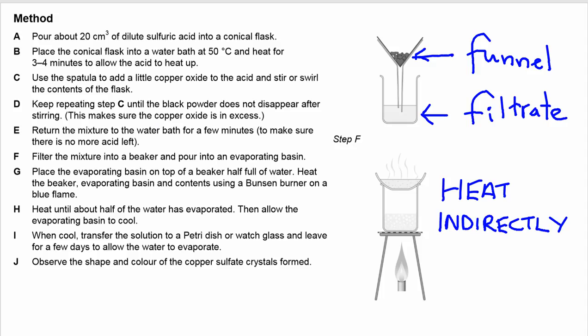So this slide shows the method given to us by Edexcel for making our soluble salts. So it's worth pausing the video and reading through this just to get familiar with it. In the meantime, I'm going to point out a few things.